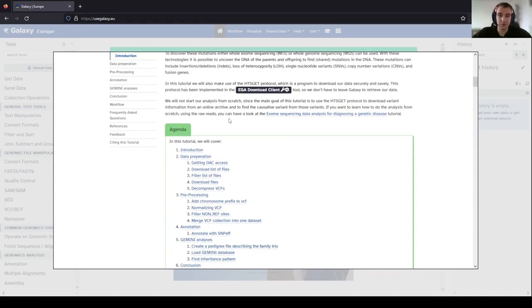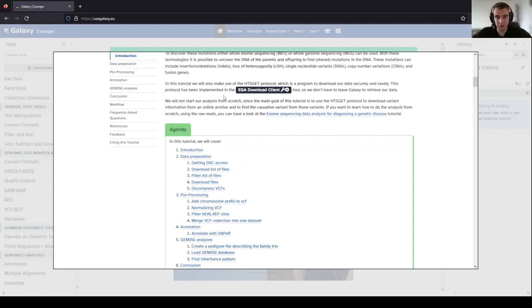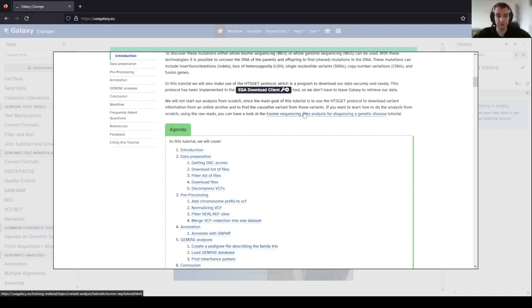In this video we will make use of the HTSGET protocol, which is a program to download data securely and safely using the EGA download client in Galaxy. We will not start our analysis from scratch because we will be directly using the VCF files, or the variant calling files. If you want to know more about doing variant calling from the start, you can follow the link here and go to the tutorial on exome sequencing data analysis for diagnosing genetic disease.